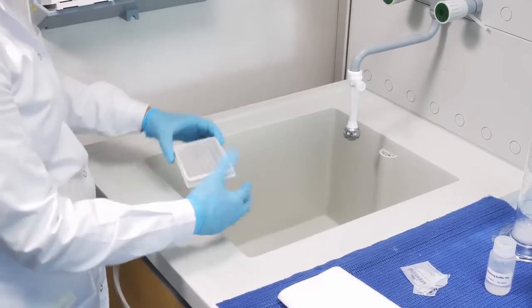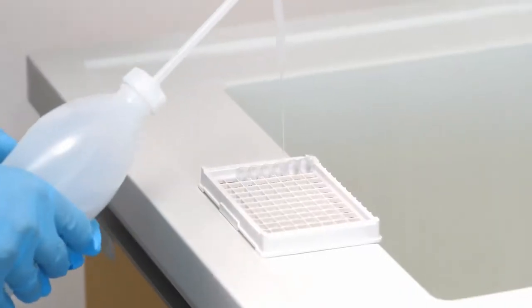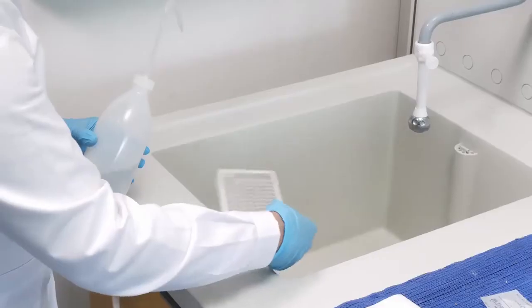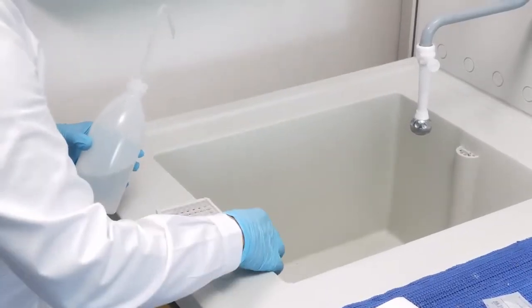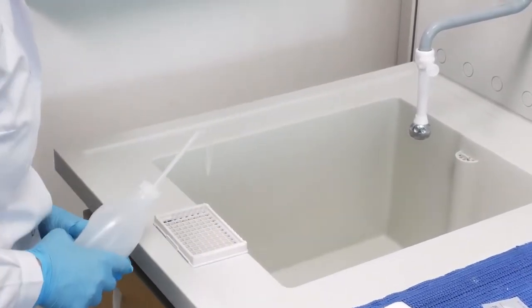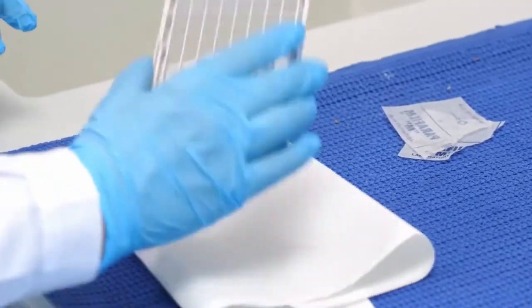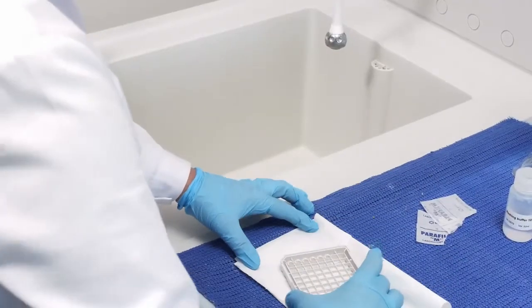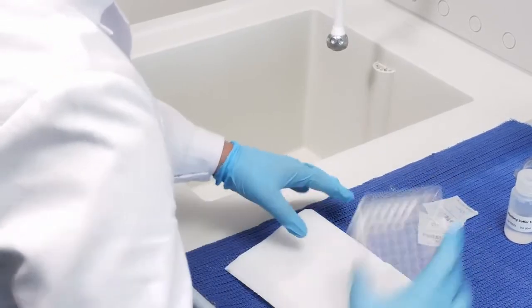Pour the liquid out from wells and fill with washing buffer using a squeeze bottle. Pour the liquid out and repeat the sequence 3 times. Remove the remaining droplets by tapping the microplate upside down vigorously against absorbent paper.